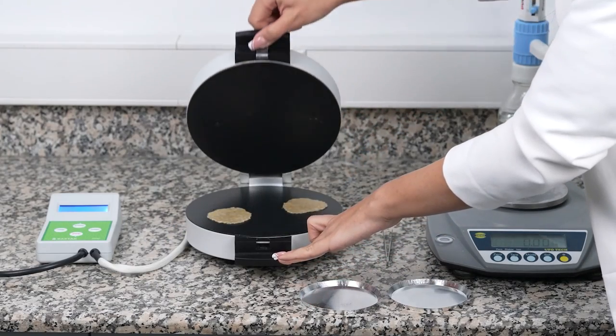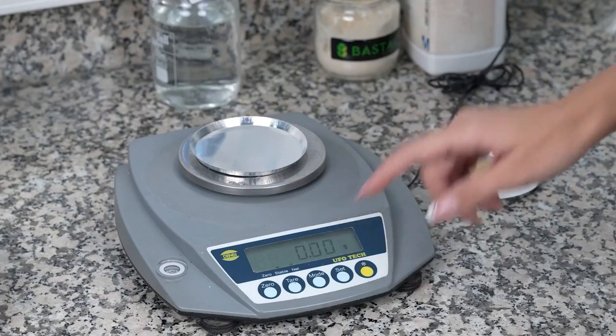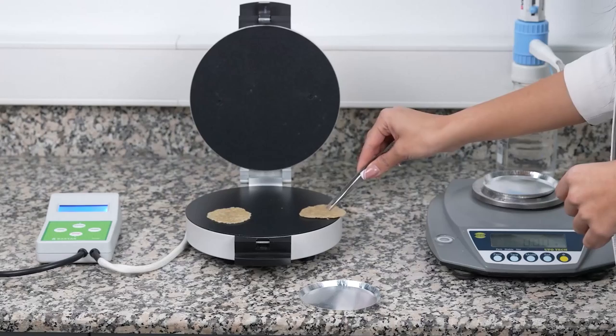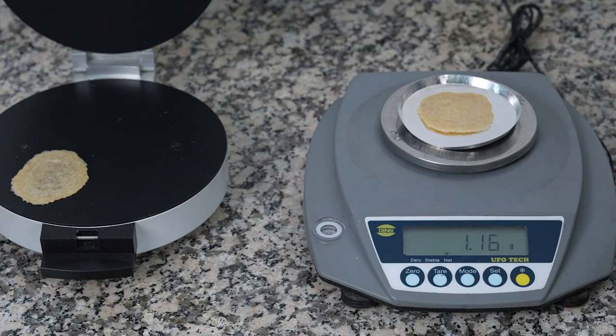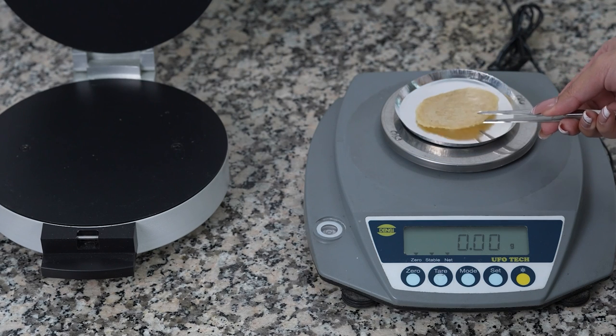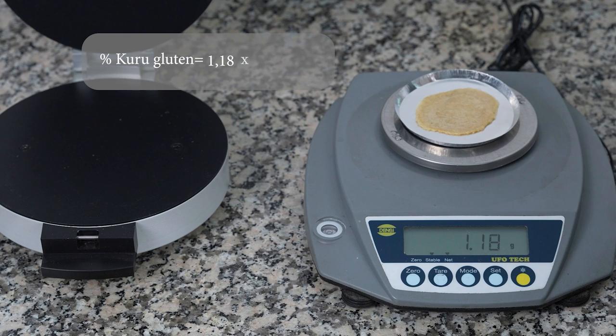When the test is over, the device gives an audible warning and the top cover is opened by the operator. A scale with 0.01 precision is used to carry out the weighing process of dried gluten. For this purpose, the weighing cup is placed on the scale and tare is taken, then the dry gluten obtained from the first pan is taken with the help of a forceps, weighed and recorded. In order to calculate the percent dry gluten value of each pan, the value obtained in weighing is multiplied by 10.